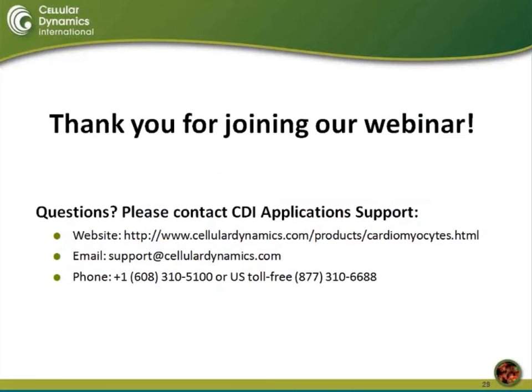And in the panels on the right, we're actually assessing the specific major ion channels in our cells: sodium, potassium, and calcium. And we're seeing a very nice dose-dependent blocking of each of these currents with the known and respective antagonists. Now, in the case of sodium, we're looking at the treatment with TTX and see a nice blocking of that current. With potassium, we treat with TEA and also see a nice dose-dependent decrease in that current, or blocking of that current. And with calcium, we have a single response to nifedipine, a calcium antagonist.